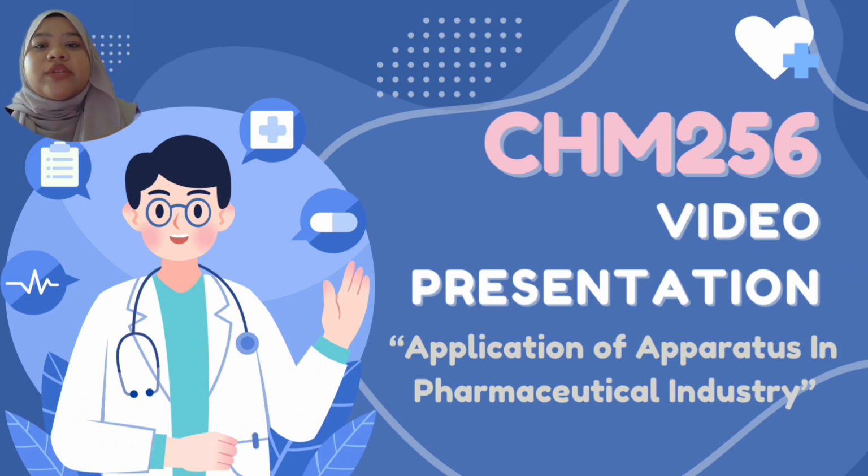This presentation will be delivered by me and my group members, where we will explain the types of apparatus used, the apparatus needed, and the procedure involved. Each of us will cover different parts, and together we will show how these apparatus play an important role in maintaining the quality consistency of pharmaceutical products.